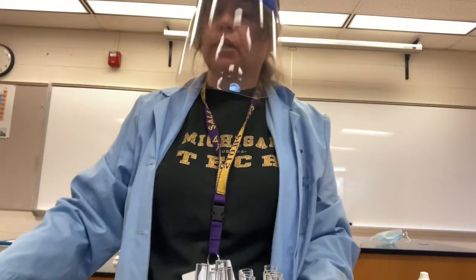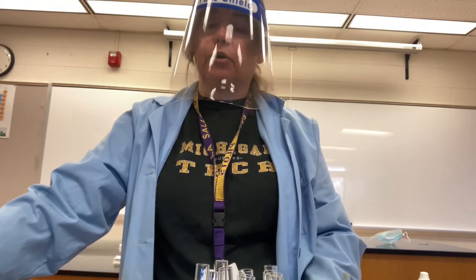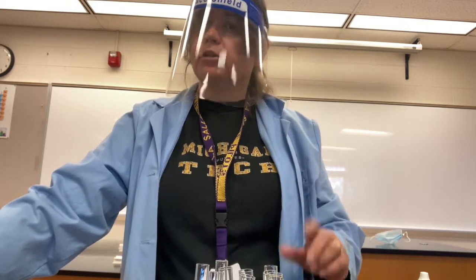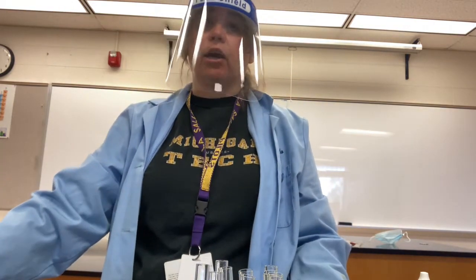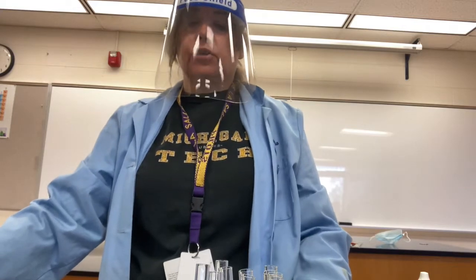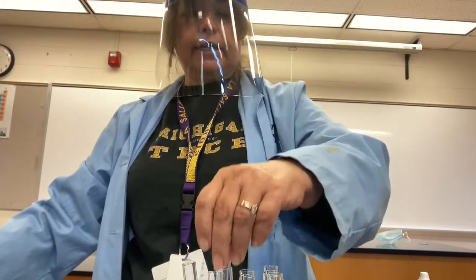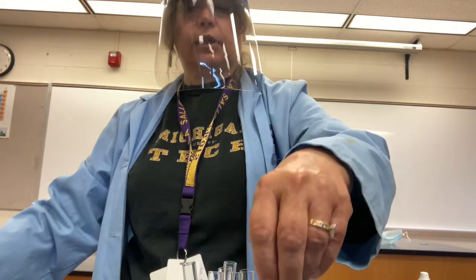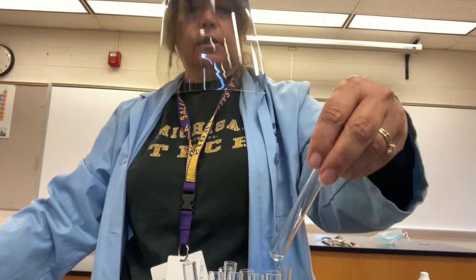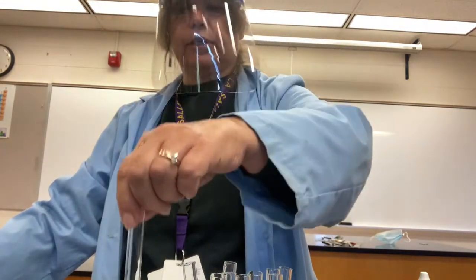Baking soda's formula is sodium bicarbonate, NaHCO3. So we already know that there's a test for sodium ions, so we're not going to demonstrate that. Our test will be for the bicarbonate ion. So we will start by taking some baking soda. Let me find a clean test tube here. Ooh, I just cleaned one out earlier. Oh, there we go, clean test tube.